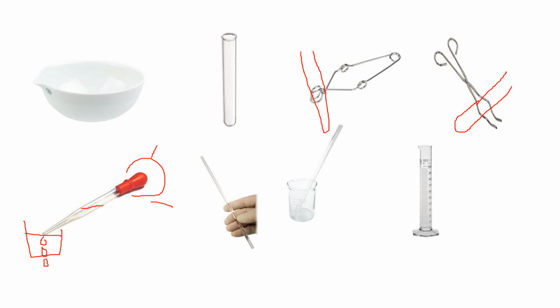How about this? Everybody knows that. This is called a measuring cylinder. It's calibrated, as I mentioned, so you can find a range of volumes in the measuring cylinder, right? If you want to measure 100 milliliters of liquid, you choose the 100 milliliter cylinder, it's more accurate. 50, 25, or 1 liter, it's a range. So have a look around your lab and see how many measuring cylinders you have. It helps to accurately measure the volume of liquids.